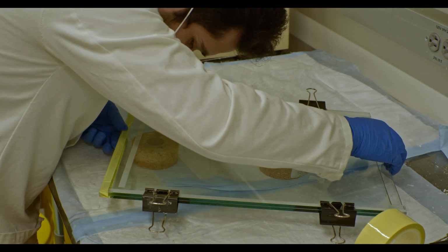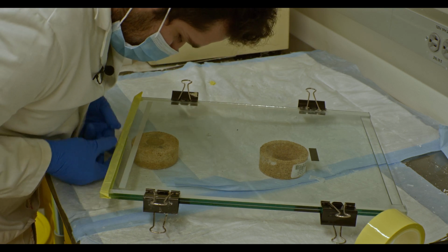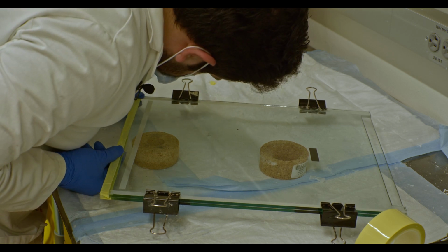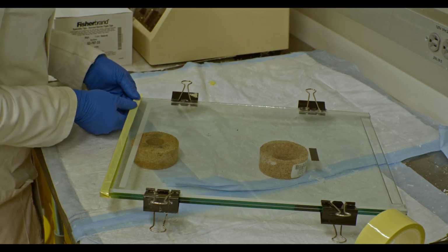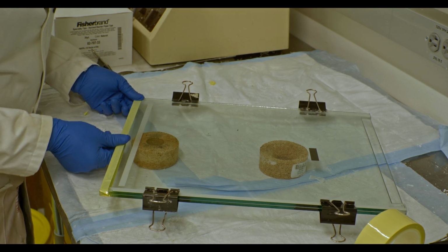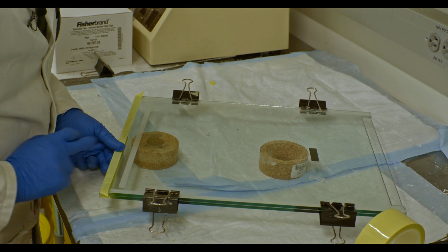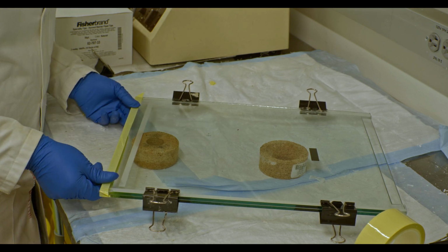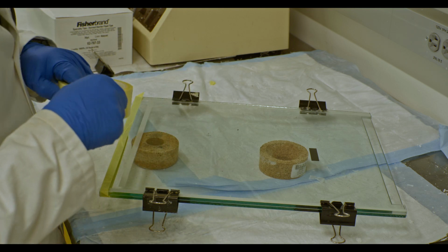Make sure you do the same with the back. The back is a little harder to see, but of course, if you angle your head, you can see the back and how that tape is also coming along. All right. You can, of course, use a second layer of tape if you so wish, in order to make sure that the bottom is effectively sealed. I have had personal experience that whenever the gel really starts to leak, it leaks out of these corners. So I actually like to instead tape up the corners a little bit better, but this will be done a few times.